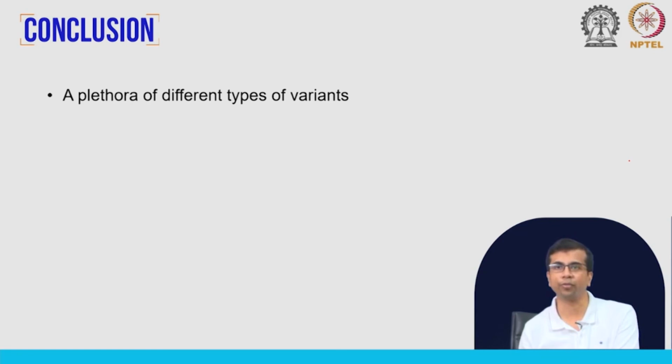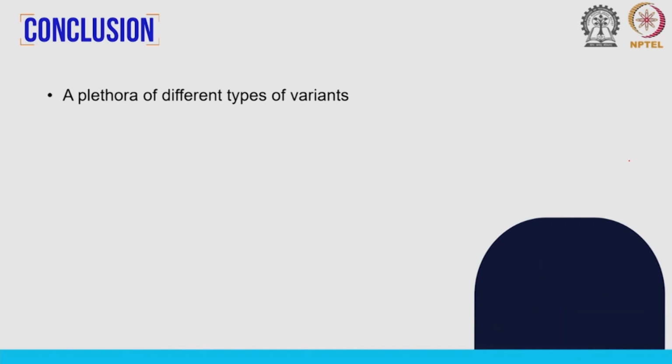We will come to the structural variant analysis and discuss that in much more detail. Very briefly we talked about copy number variations or CNVs, but apart from that we also have non-CNV SVs, and we also have complex structural variants, which are a combination of CNVs as well as non-CNV SVs.